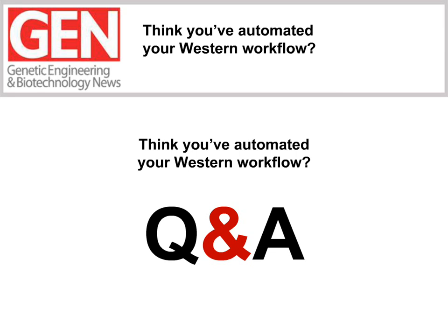Once the protein has been immobilized, we can use, again, the vacuum to remove everything that hasn't been immobilized, so the separation matrix, stacking matrix, which leaves an empty lumen that we can now flush the primary and secondary antibody through the capillary using, again, the vacuum. All right, Catherine, I'm back to you.